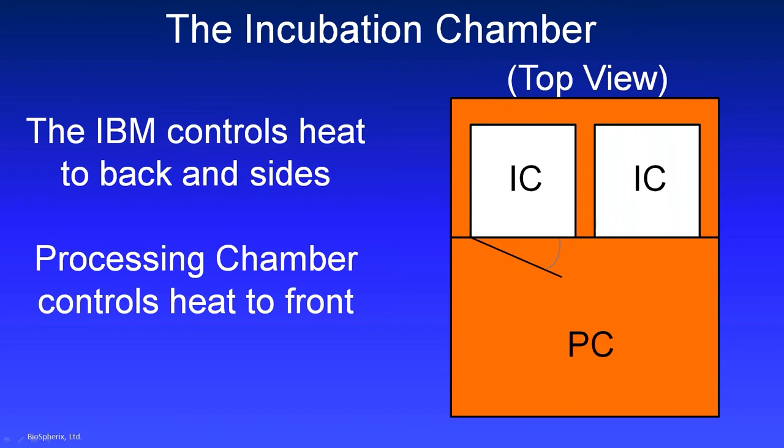Likewise, you need to keep the processing chamber atmosphere and floor set to 37 degrees for good control of temperature in the incubation chamber. These are all designed to work together as a single module.